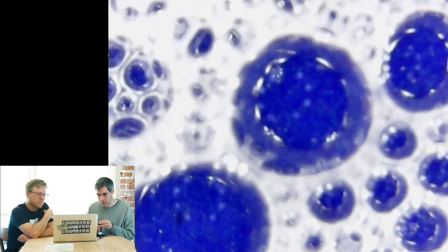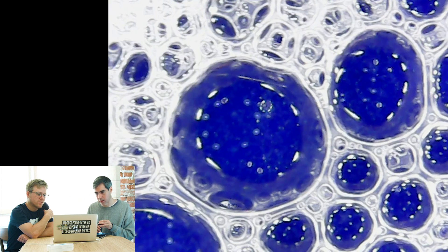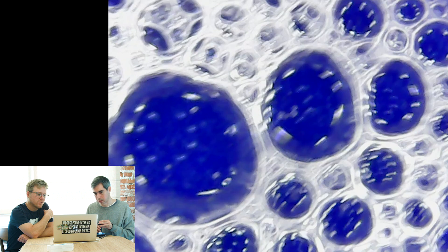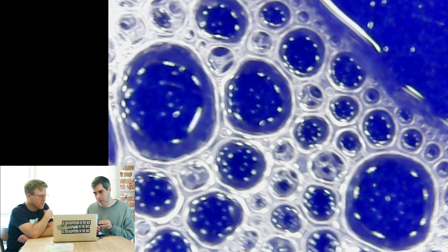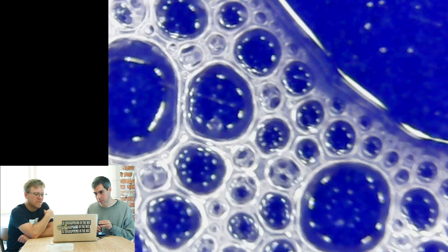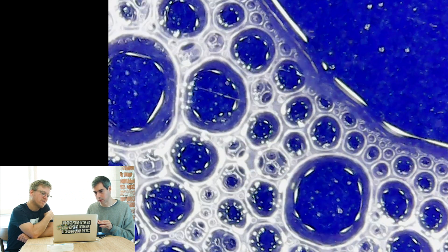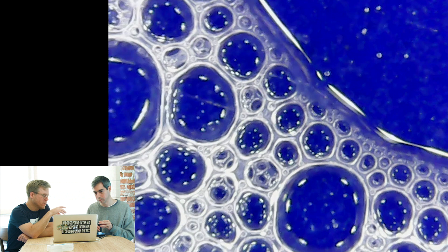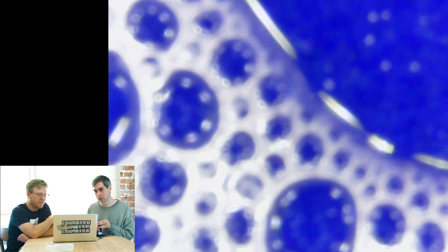It's like eggs. It looks like frog eggs or something. It does look kind of science fiction-y in a way. I mean, it does look like they're eggs — some sort of egg type thing. Are they moving? Yeah, they're just moving by themselves. It's weird that it's just moving like that. Well, you touched it, so you know how things cling. I guess they're just clinging. The clinging effect.